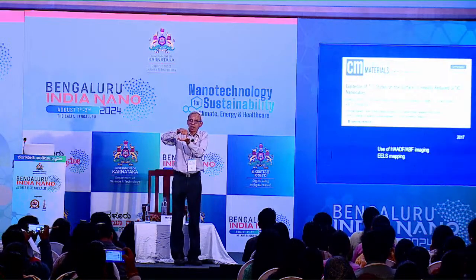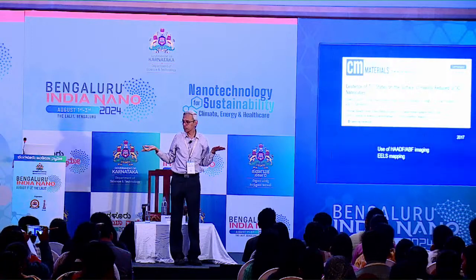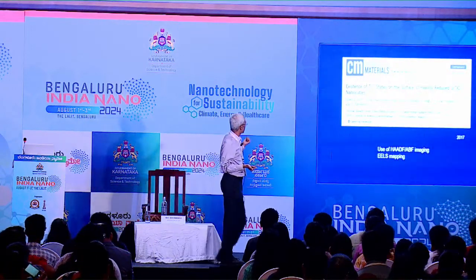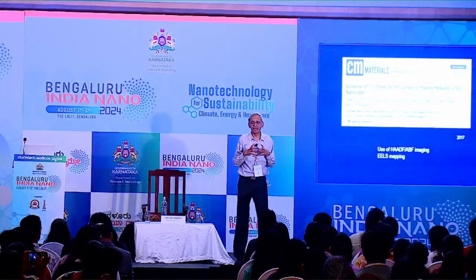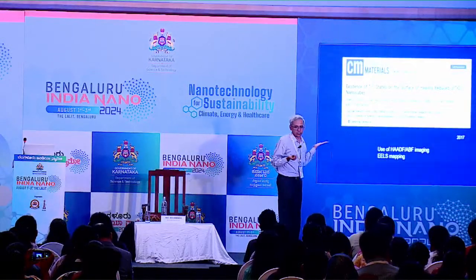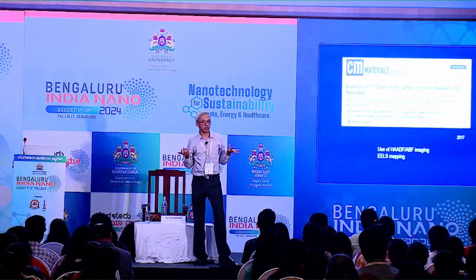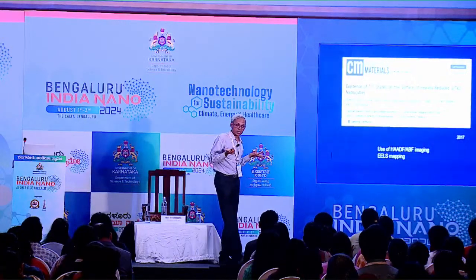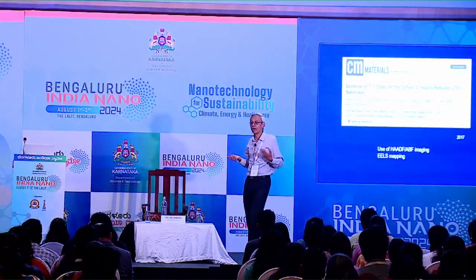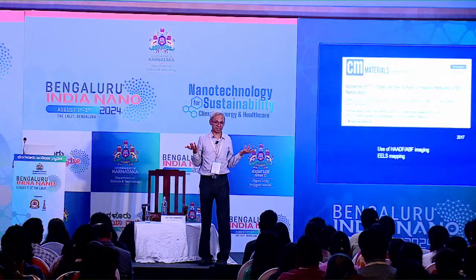Imagine we can get a fine probe, we can locate individual atomic columns, and we can get electron energy loss spectra, and we can actually map out the oxidation state. I'm going to show you an example of strontium titanate, which is highly reduced. In normal strontium titanate, strontium is +2, titanium is +4, oxygen obviously 2-. Therefore, it's simple. But when you heat it under reducing conditions, titanium can go to a lower oxidation state.